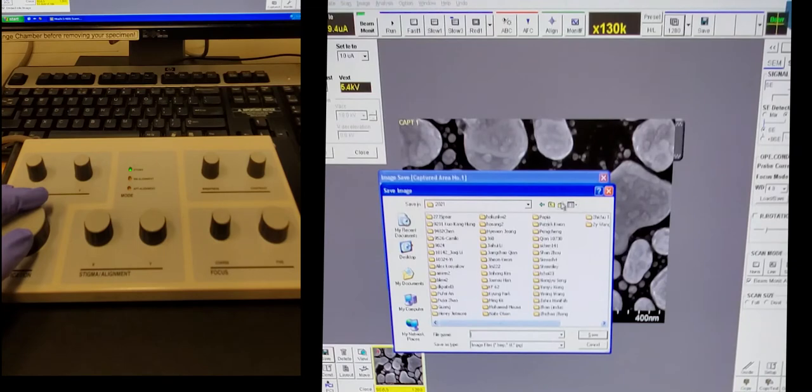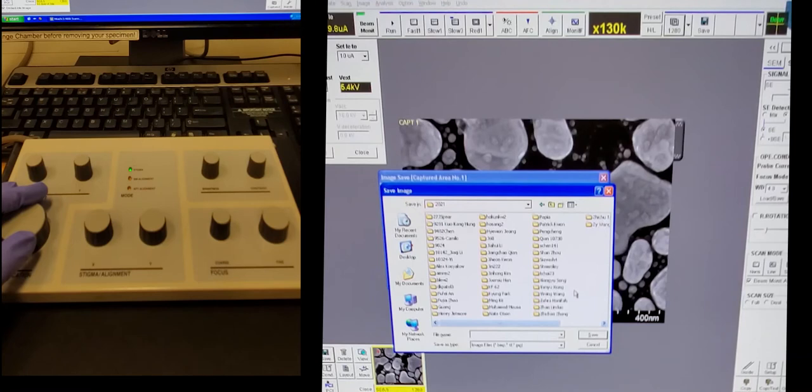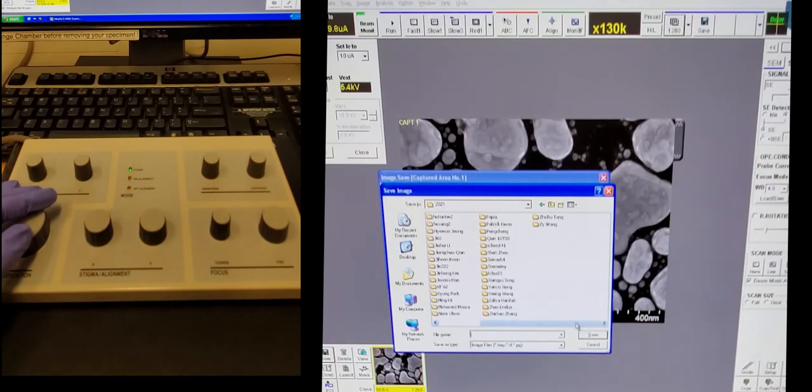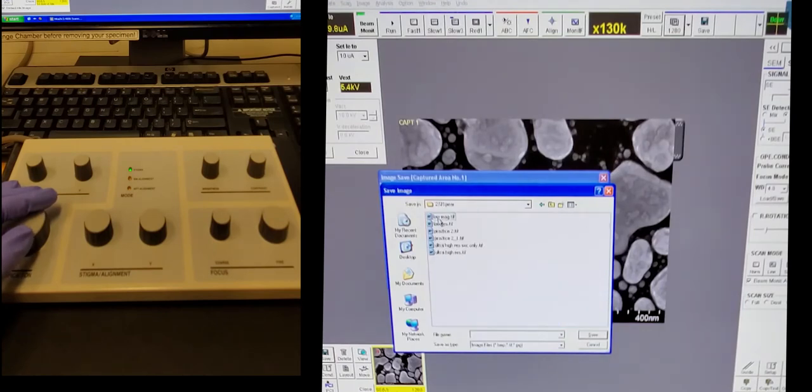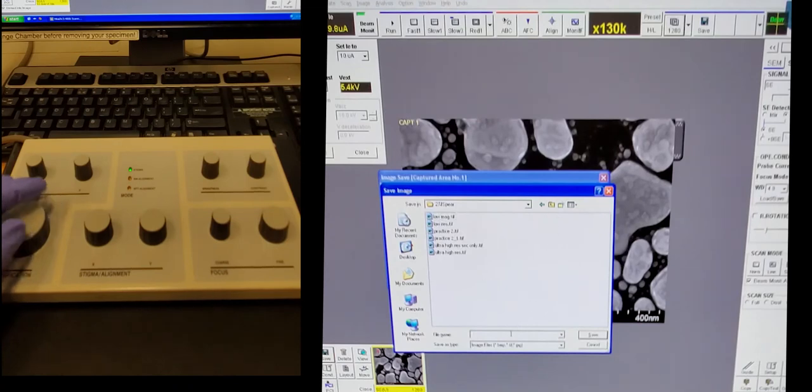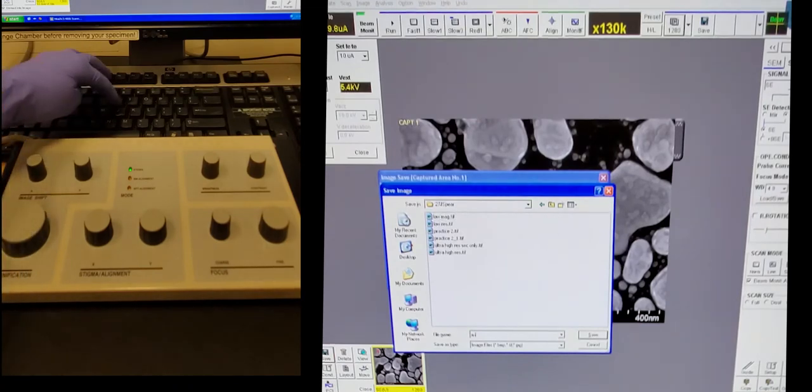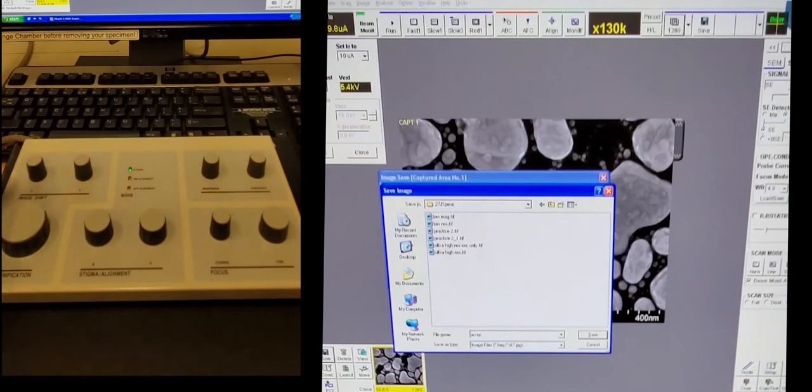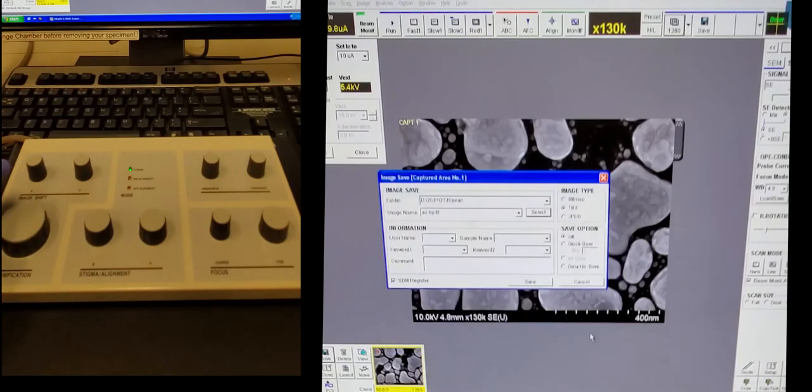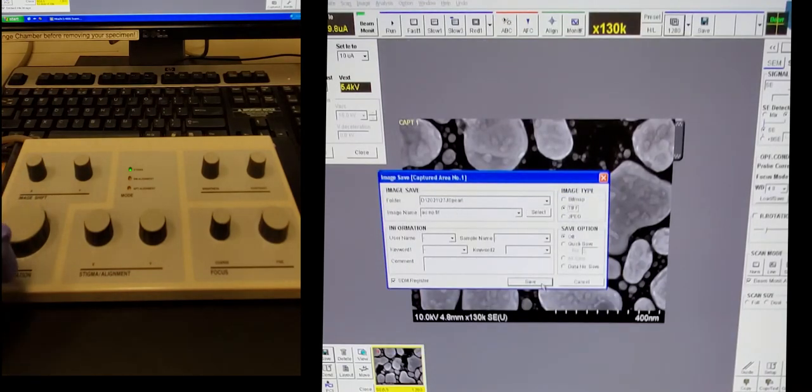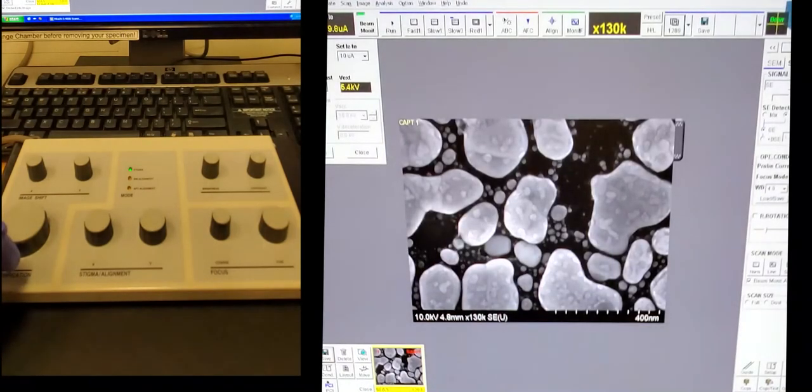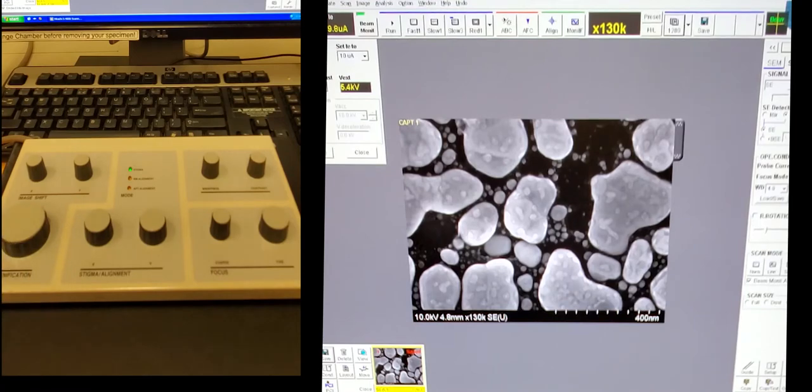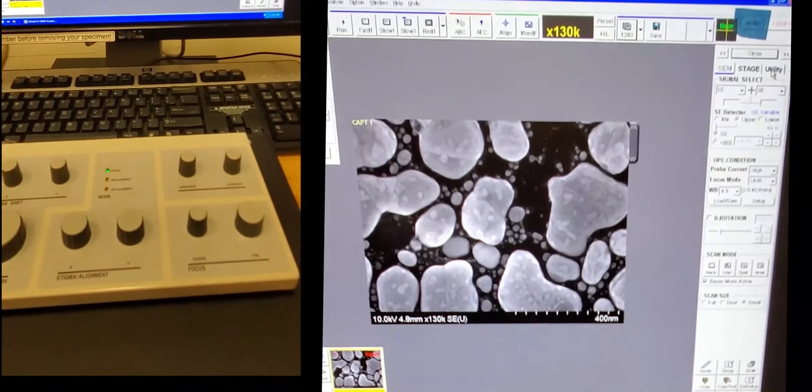The last step is click the save button in the bottom left, navigate to the users folder, make yourself a folder or open your current one and then you will save the data into that folder. You choose the file type over here on the right and then you can click save. You can also save these images as a batch at the very end by just highlighting all of them across the bottom and then clicking save and saving all under one name that gets incremented.